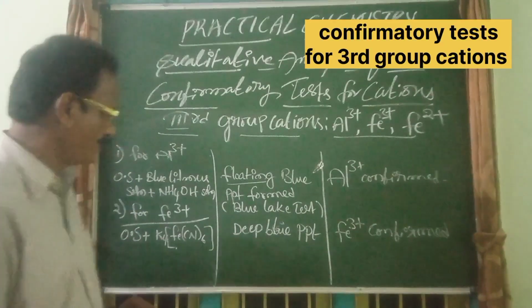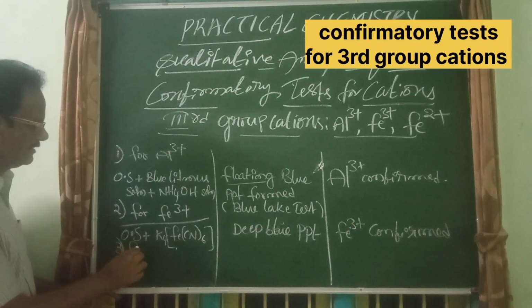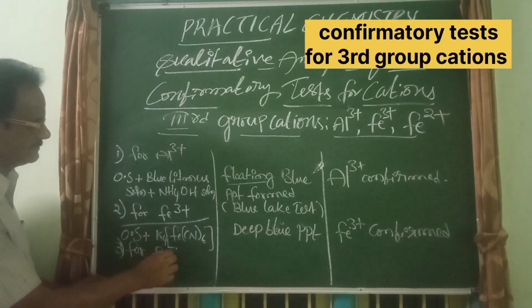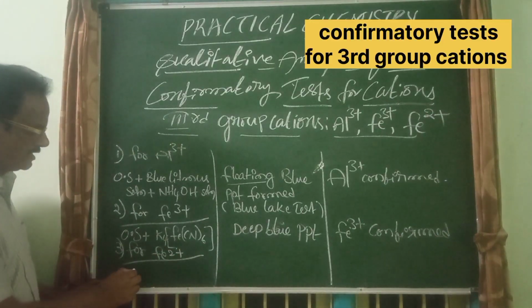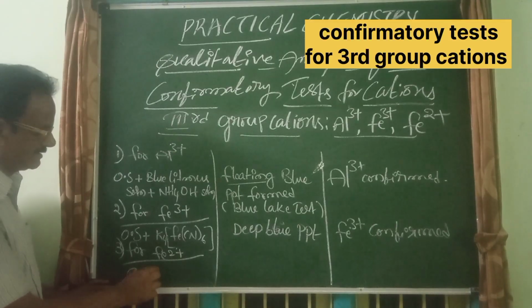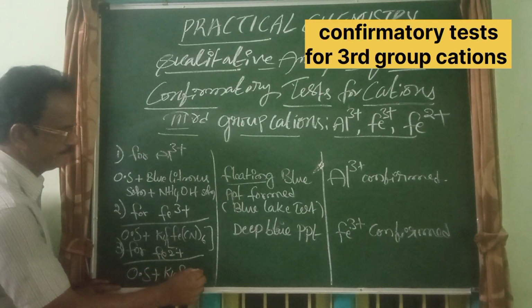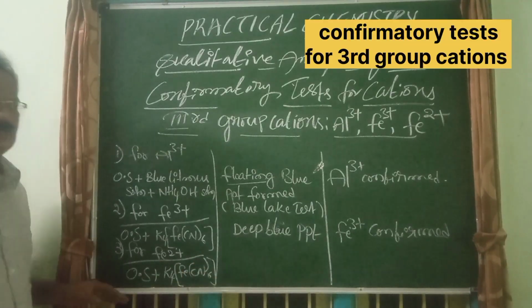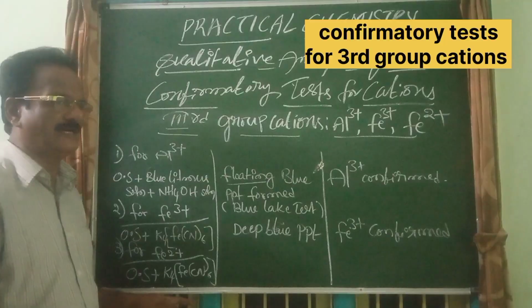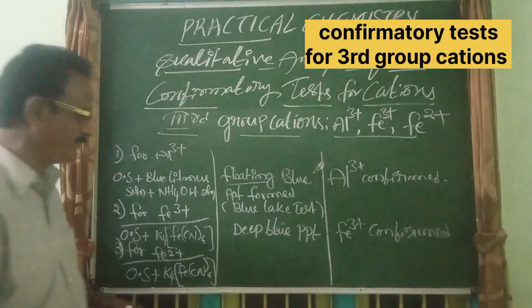Okay, let us see the test for Fe2+. Here the same reagent, that is potassium ferrocyanide solution, is to be added to the original solution.